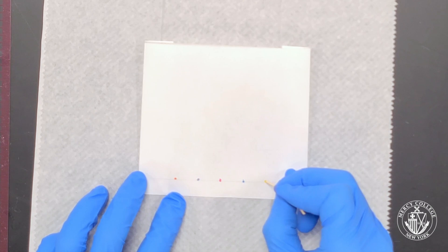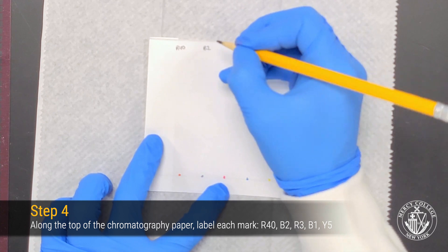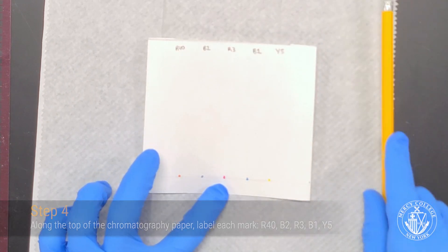Once you've spotted your dyes, you need to label them. Use a pencil to label each lane of your chromatogram. Remember that you want to avoid using ink because ink contains dyes that can also smear when you're developing your chromatogram.